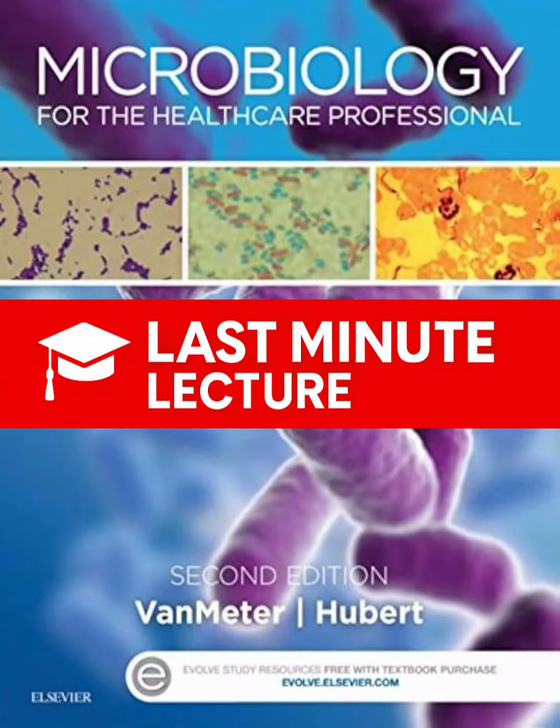The most basic is just a simple stain. Right. Simple stains use just one dye, usually a basic dye which has a positive charge. Bacterial cell surfaces are typically negatively charged, so the positive dye sticks to them, making them visible. It shows you their basic shape, size, and how they're arranged: clumps, chains, etc.